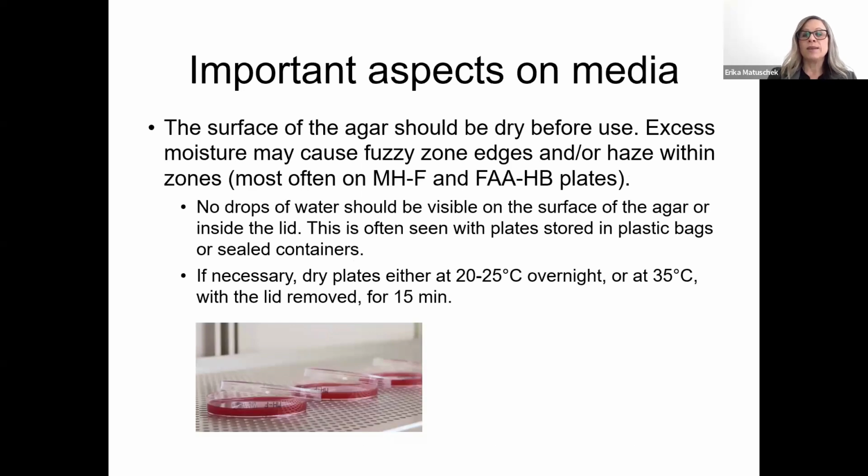Another important aspect is that the plates should not be too humid when they are used. The surface of the agar should be dry before you inoculate them. Excess humidity can cause problems with fuzzy zones and/or haze within zones, making it difficult to read zone diameters. This is most often seen on MHF and FAAHB plates.